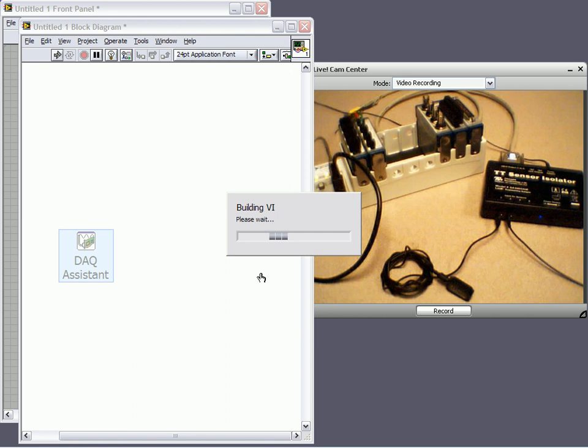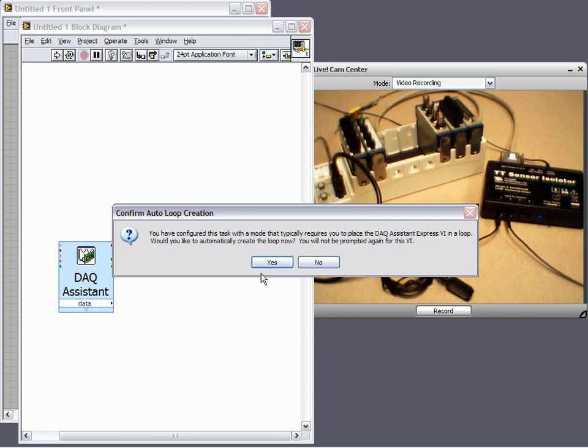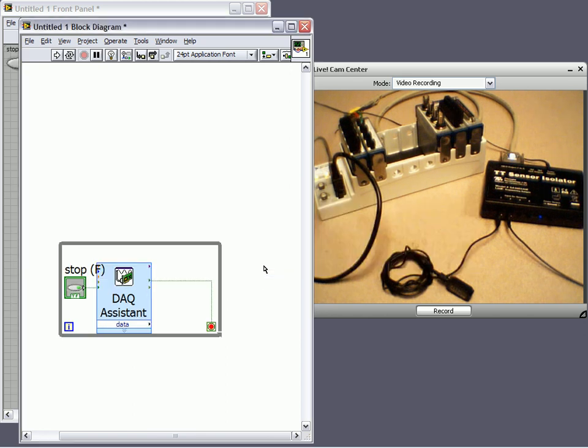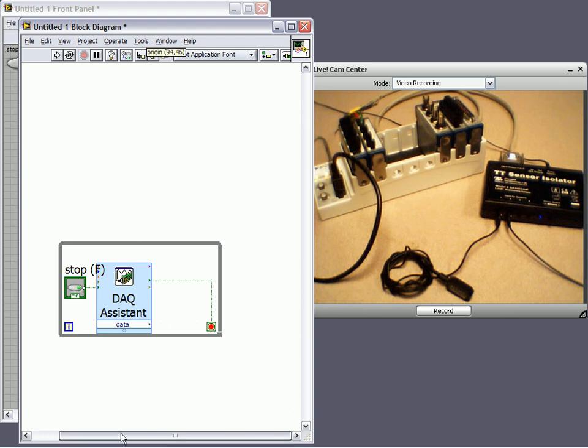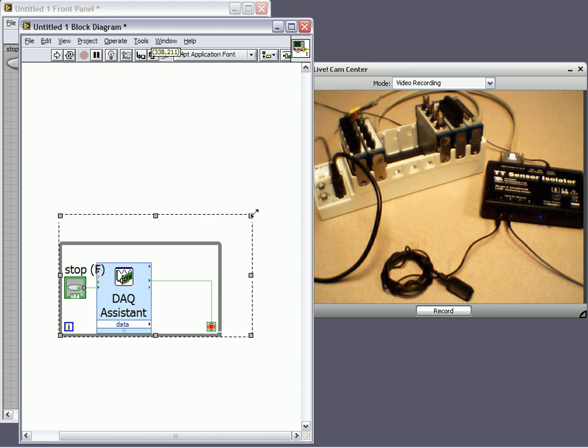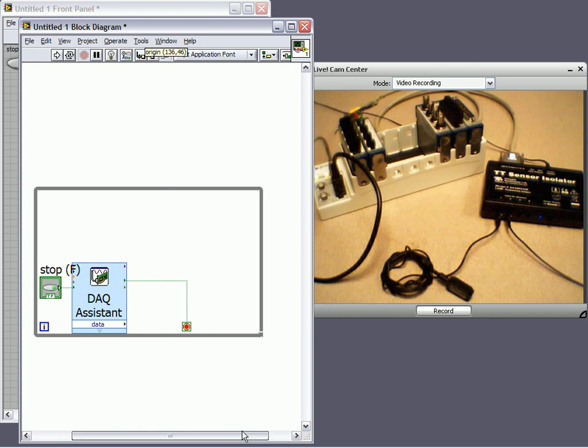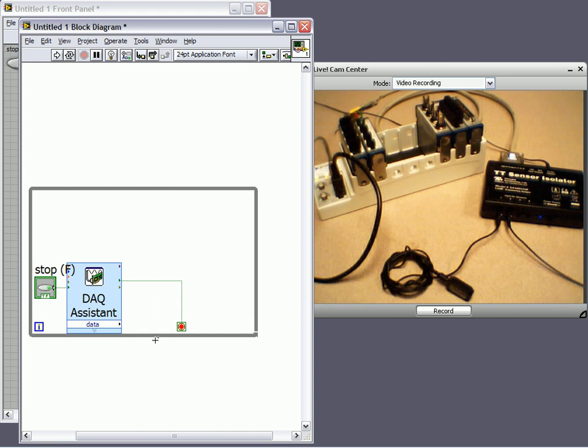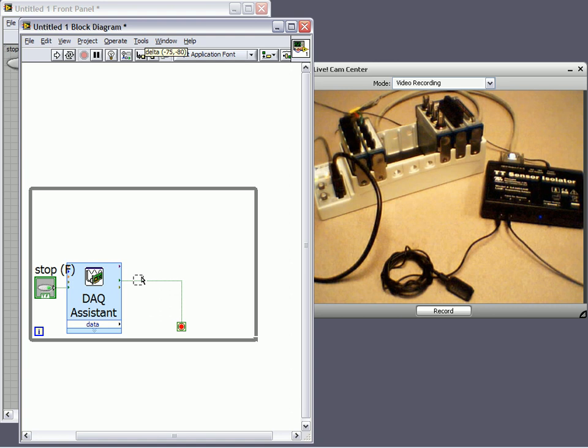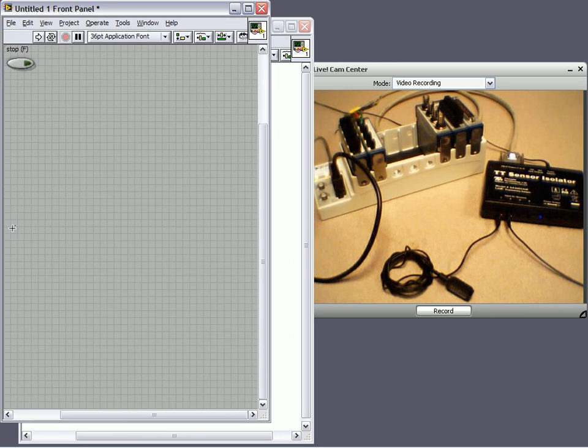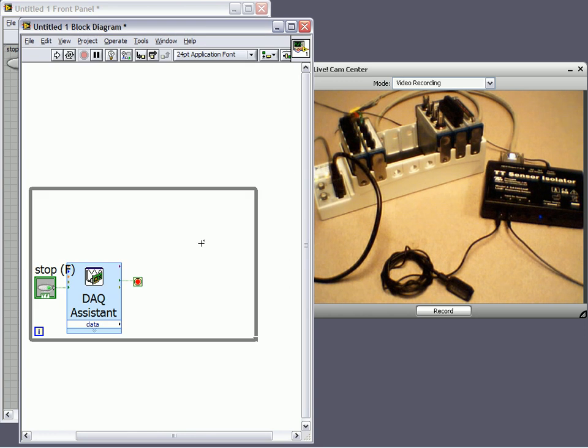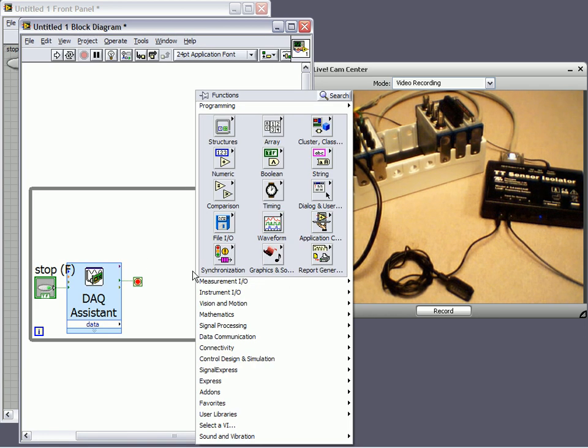It's going to ask if I'd like to place this DAQ Assistant in the loop, and since I'm acquiring continuously, I'm going to place Yes. Now, you'll notice that a while loop has been placed around the DAQ Assistant. The loop has a conditional terminal that when the stop button that's been added to the front panel here is pressed, a true value is seen at the conditional terminal, and the while loop stops.